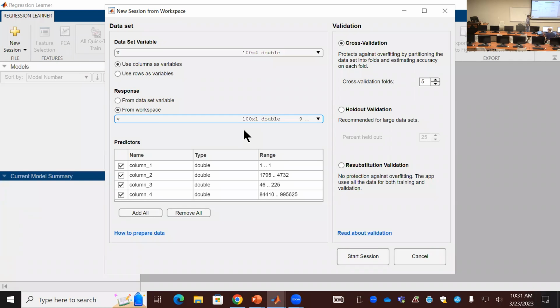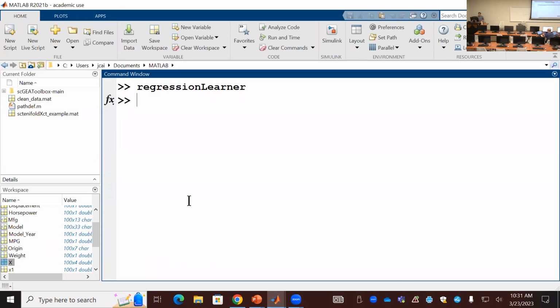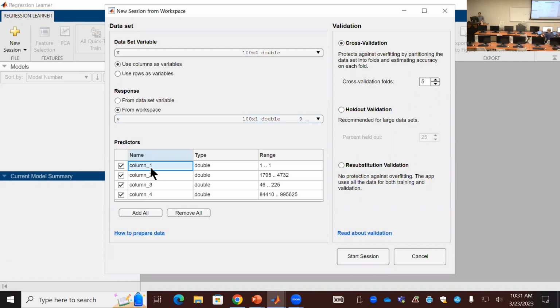So that's the Y. Let's see if I can rename this.